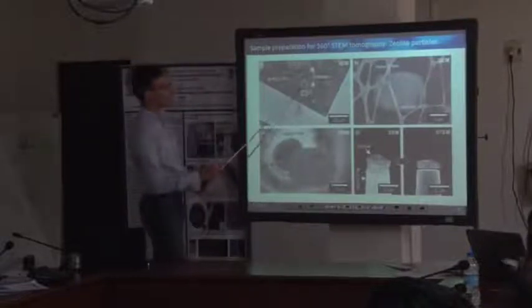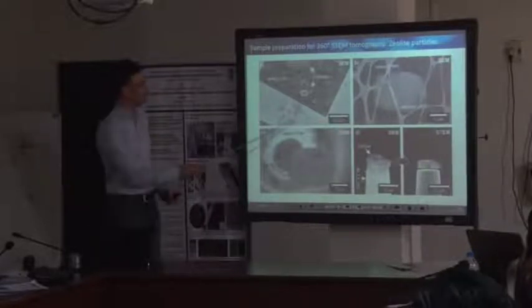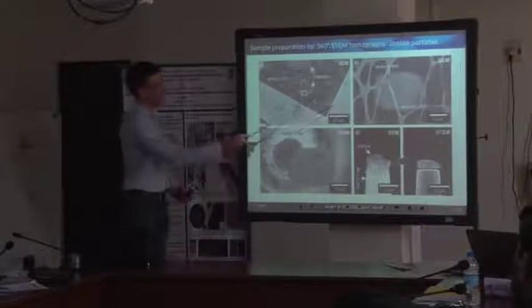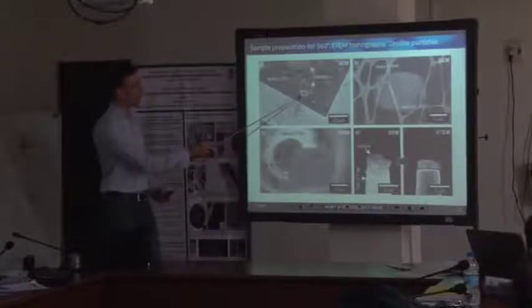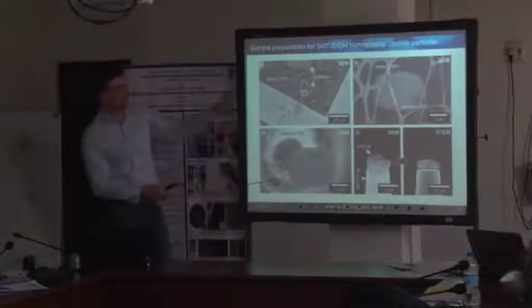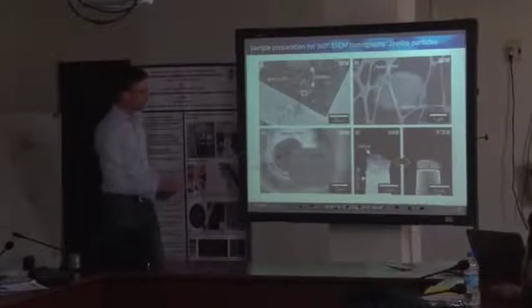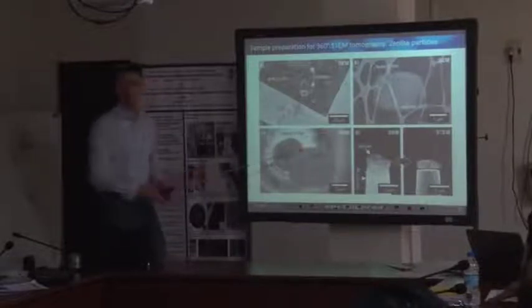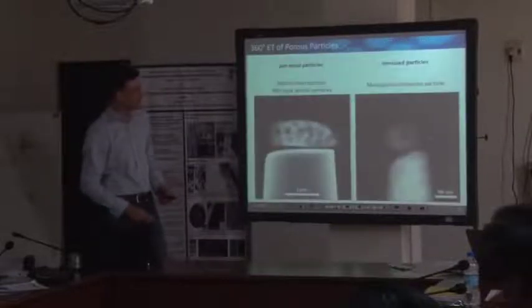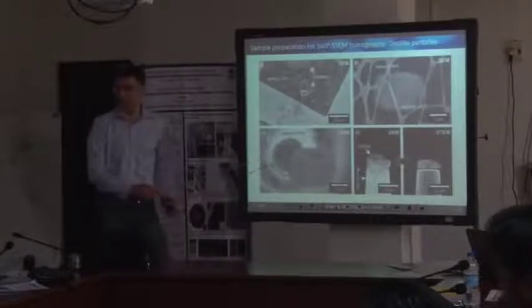This is the particle just dispersed, as for any kind of TEM or SEM analysis, onto a TEM support film. This is our grid here, our copper grid. This is the support film. There are some of these particles. This one is situated on the bottom of our support film. We look from the top. And this is already our pillar that approaches from underneath using our stage. So the pillar is just mounted to the stage of our microscope.